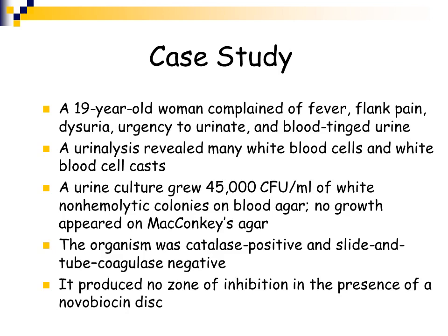It did not have a zone around the Novobiocin disc in the Novobiocin susceptibility test. So if there was no zone, that means that the organism grows right up against the disc. So when you read a case study like this, this is the way you need to think in microbiology, just how I worded out that case. You know that this infection in this individual is caused by Staphylococcus saprophyticus.